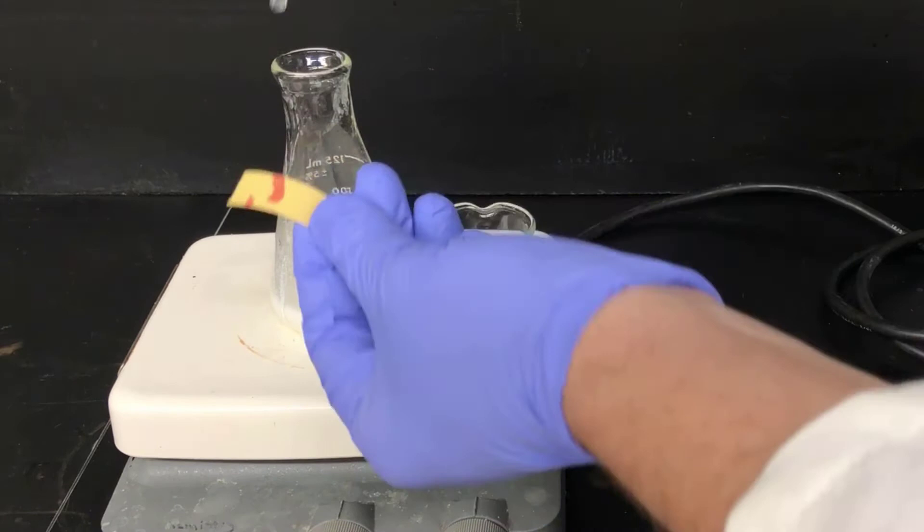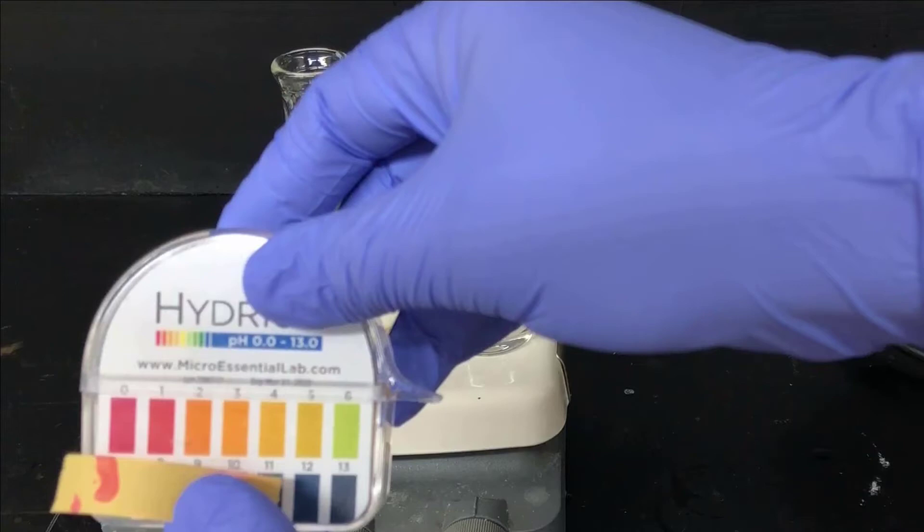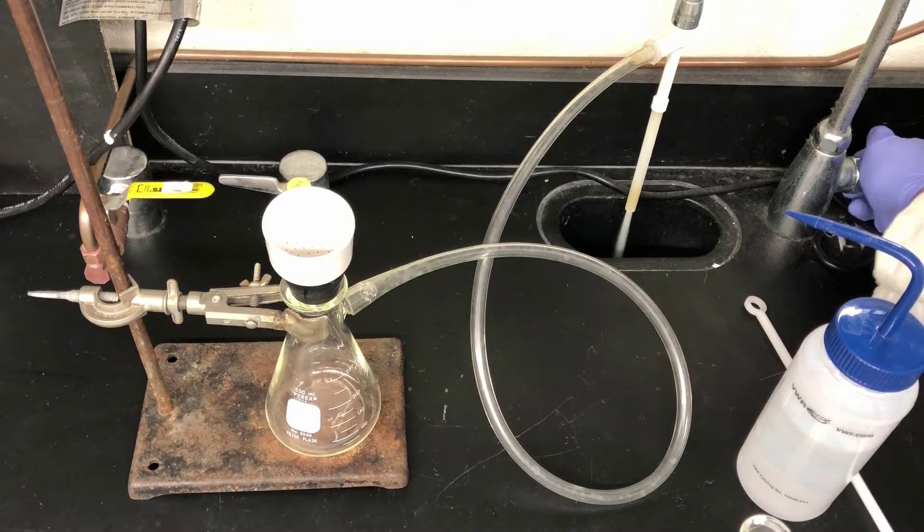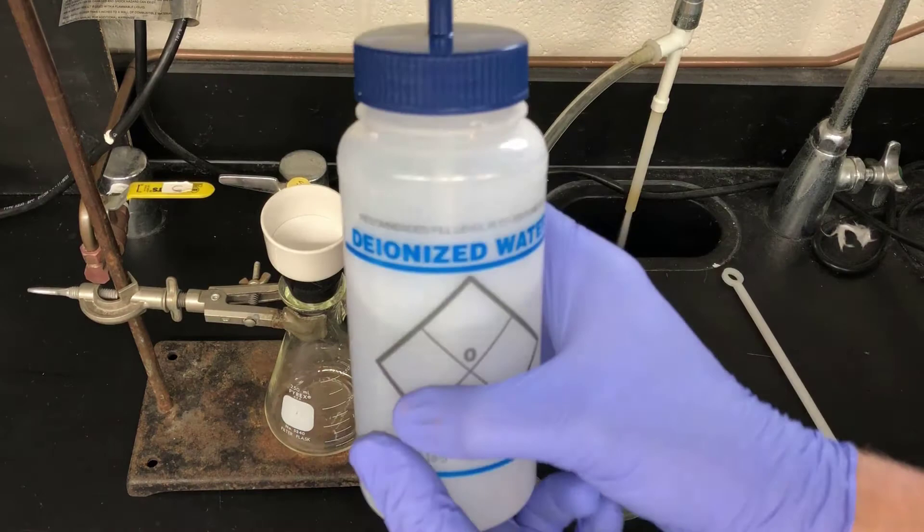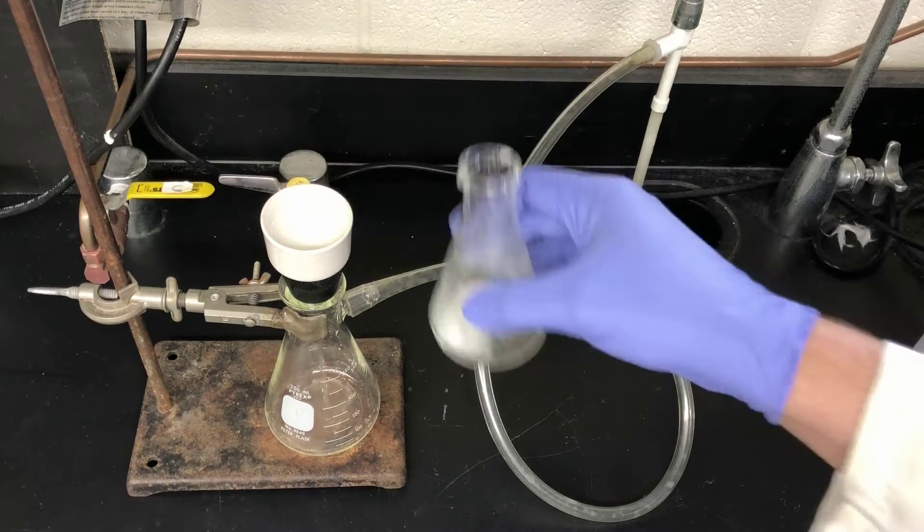Now I'll be vacuum filtering the product to remove it from the water. I'll turn on a water aspirator, get my Buchner funnel, add a piece of filter paper to it, put it back on the filter flask, and wet it with a little bit of water to seat the filter paper against the holes in the Buchner funnel. Now I'm filtering my benzoic acid product. I'll rinse the Erlenmeyer flask with some deionized water to try to get more of the benzoic acid transferred into the Buchner funnel.